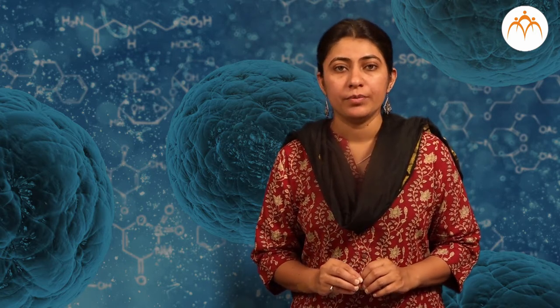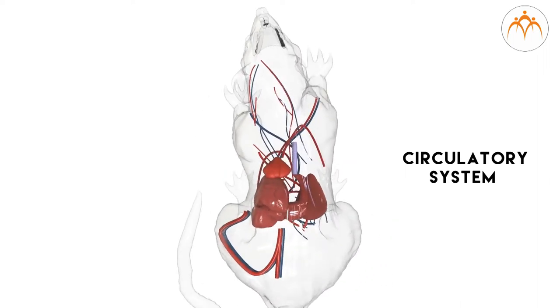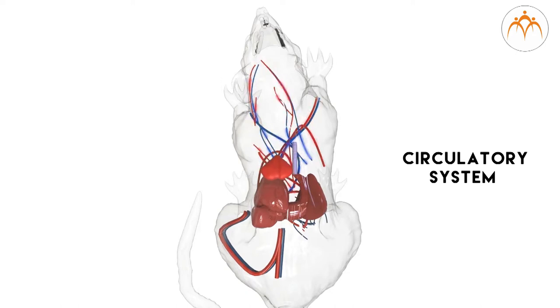Apart from the digestive system, there are many other important organs that can be seen inside the body. The heart of the rat acts as a pumping organ and is located in the chest region. Structurally, it is similar to the human heart, having four chambers. There is closed blood circulation in rats. The heart, blood, and blood vessels constitute the circulatory system of the rat.